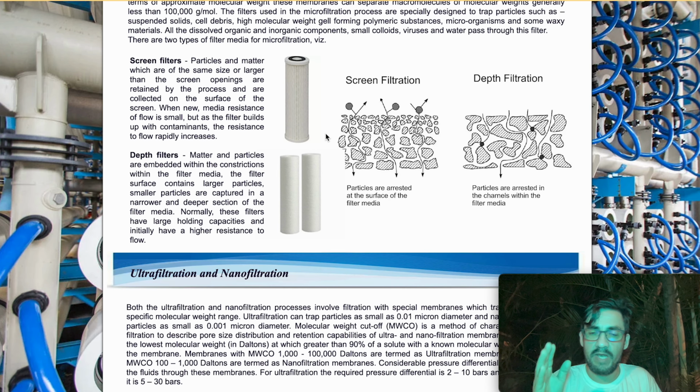a cartridge or whatever and a solution that goes in one pipe. Solids basically coagulate, clog up that filter paper or cartridge or whatever, and then a clean solution permeates through that paper or cartridge, right? And they can be depth filters like lenticular, but that's dead-end filtration, basically. Membranes are different. Membranes are different because we are not talking about size as much as molecular weight.